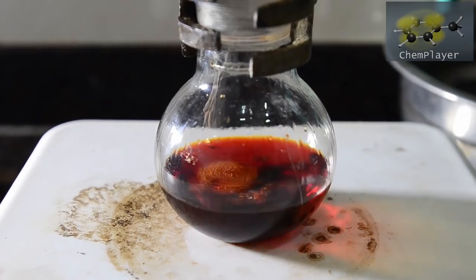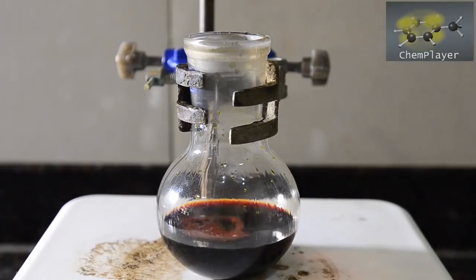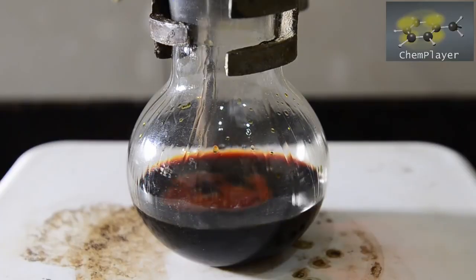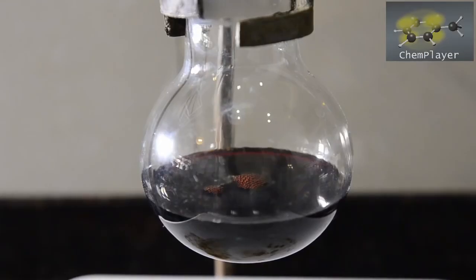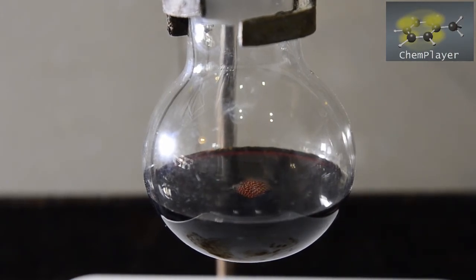We refluxed for 2 hours, and then for a further 30 minutes we removed the condenser in order to allow some ethanol and water to evaporate. Then we switched off the heat and allowed the flask to cool slightly.